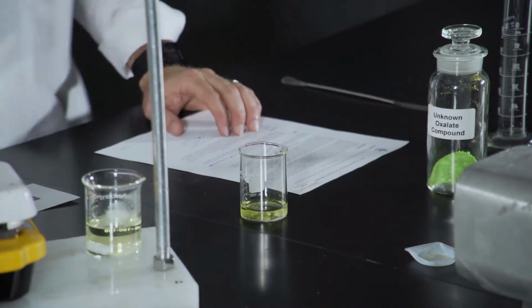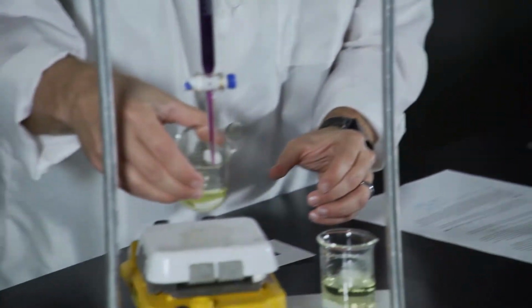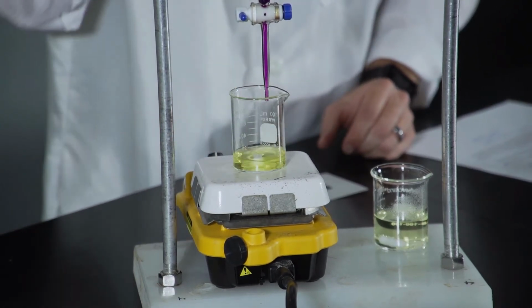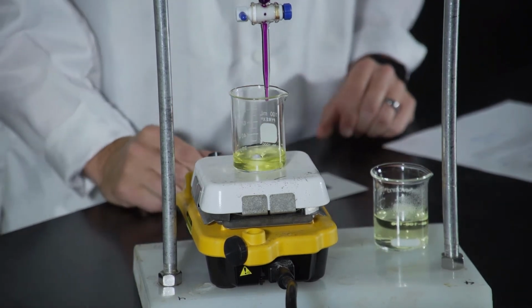And to that, we're going to add a stir bar. And we're going to go ahead and turn our stir plate on. And we're going to turn our heat on. But this is important. Go ahead and turn the heat pretty far up.